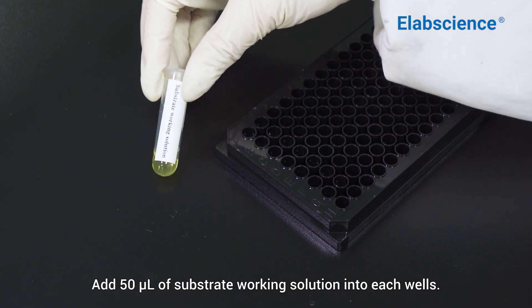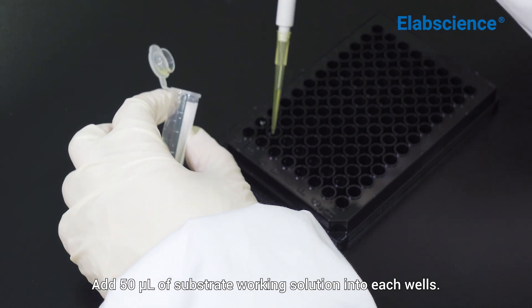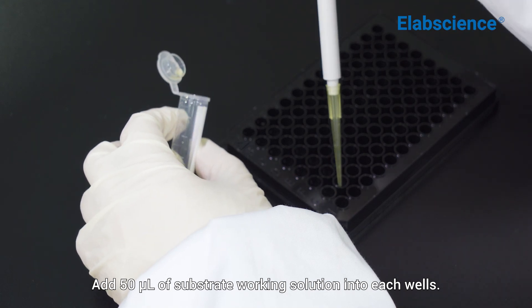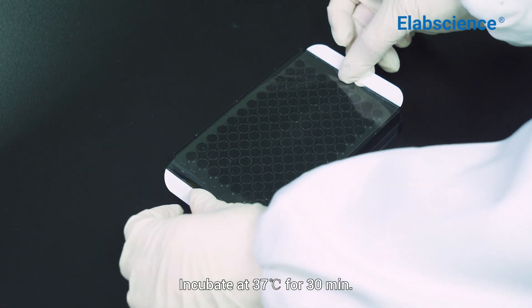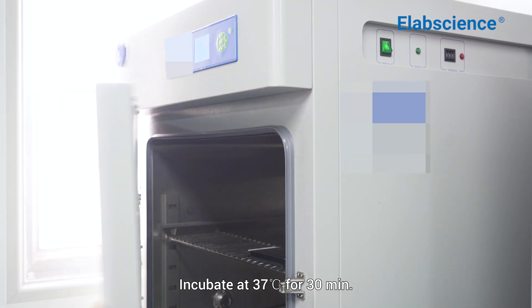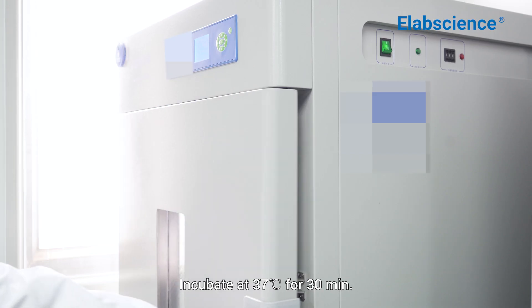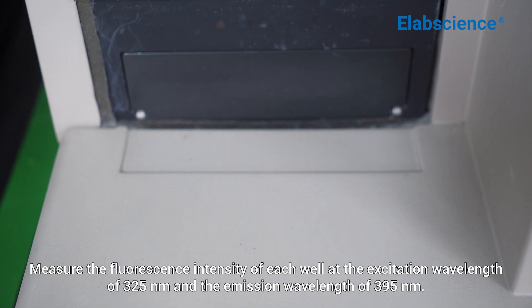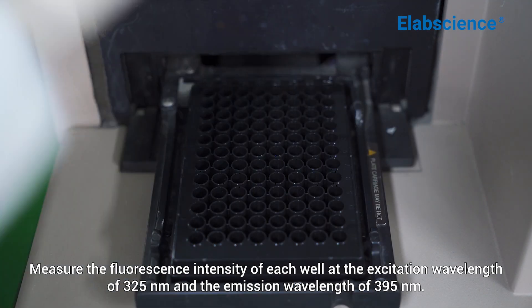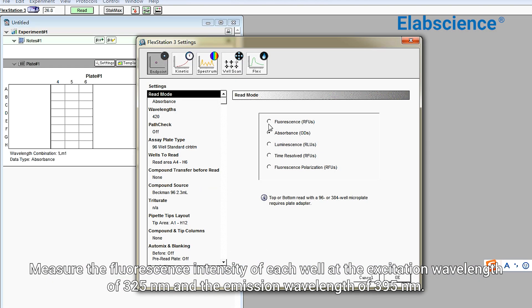Add 50 microliters of substrate working solution into each well. Incubate at 37 degrees centigrade for half an hour. Measure the fluorescence intensity of each well at the excitation wavelength of 325 nanometers and the emission wavelength of 395 nanometers.